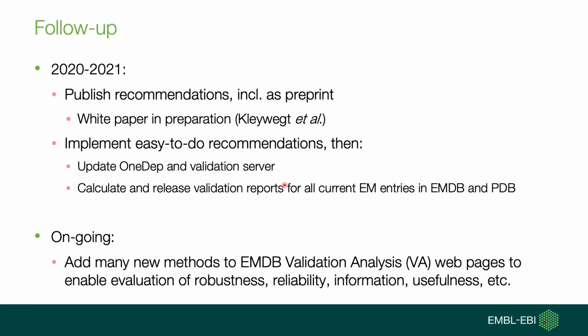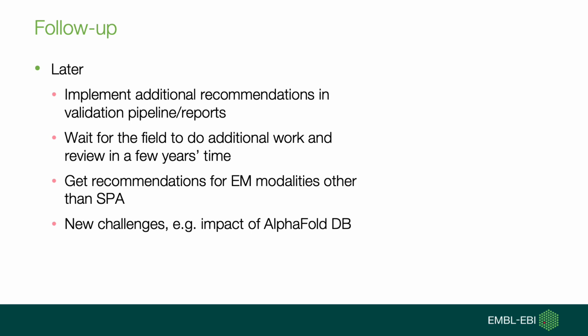And also the validation reports for all EMDB and PDB entries have been updated and released. And we're still working on this second part to add a lot more validation checks to the web pages. At a later stage, more of these methods will make their way into the validation pipeline.